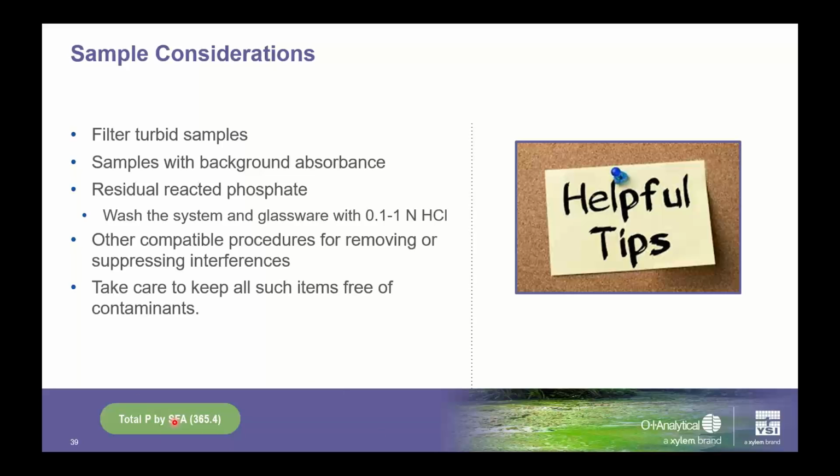And then someone is working with biofouling on an RO membrane in a desal plant, and they're wondering if there is a way to monitor the biofouling caused by algae, and whether that should be based on the chlorophyll content or the N to P ratio. Wow, that's an excellent question. And I've done something similar to that.